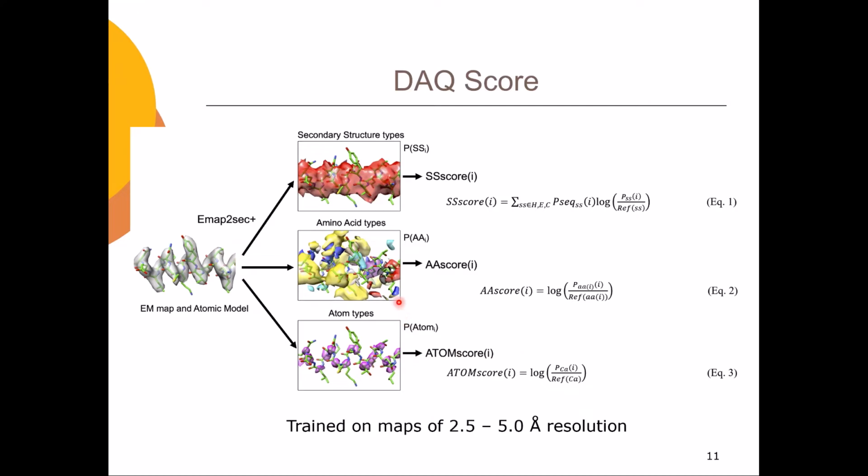And then the basic idea is that we compare the probability values coming from the deep learning against the protein structure model, and then check if they agree or not. And if they don't agree significantly for many amino acids in a row, it's highly likely that the assignment could be wrong, and it's worthwhile to check. So we can look at how the score is computed.